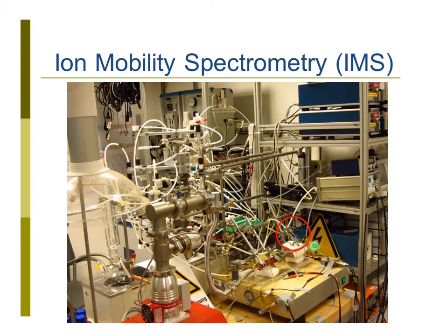And a lot of tubes here for the gas supplies so that also there you can work quantitatively. How much gas do I have from which substance for your tests and so on. So that's not just like, yeah, I have gas. No, you need to know how much.